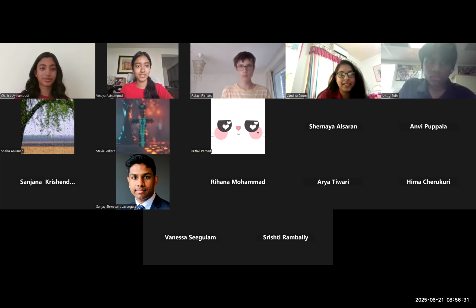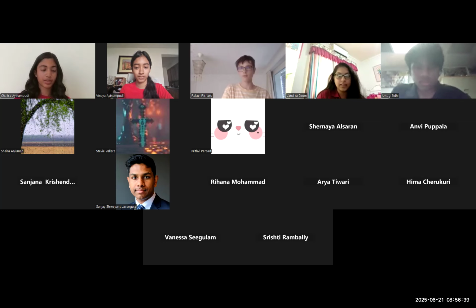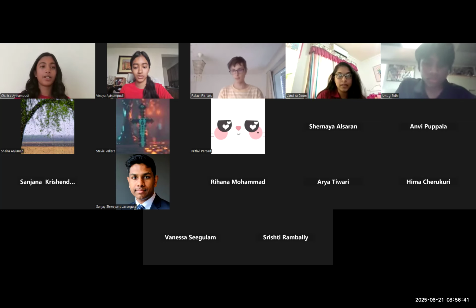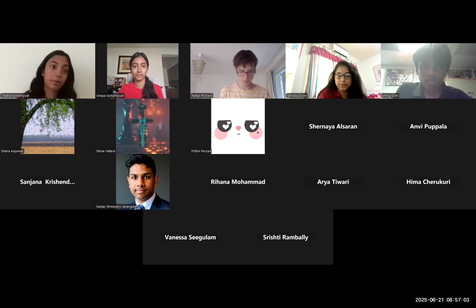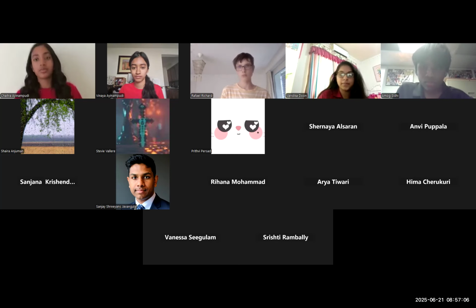Also, this lab has a second part. It's called, I don't remember what exactly. Let me double check. But there is a second part for this. So if anyone's interested, you guys could do the second part as well, which correlates to transforming the bacteria. It's plating transformed bacteria. So right now we just transformed the bacteria and it's plating it. I will send the link to everyone in the chat. It is right here. This is the second part.